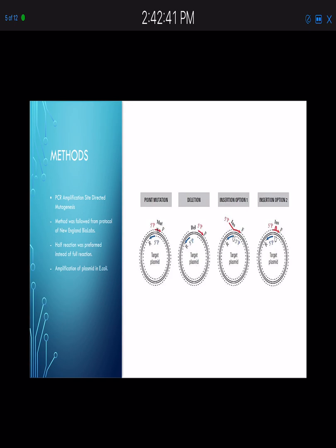These primers were introduced to the plasmid, and through site-directed mutagenesis, they were able to attach to the site where they are encoded for the plasmid and do point mutations. The annealing temp for this was 65 degrees Celsius. After site-directed mutagenesis, the plasmids were then introduced to E. coli, where they were amplified many times to get many copies of the new plasmid.